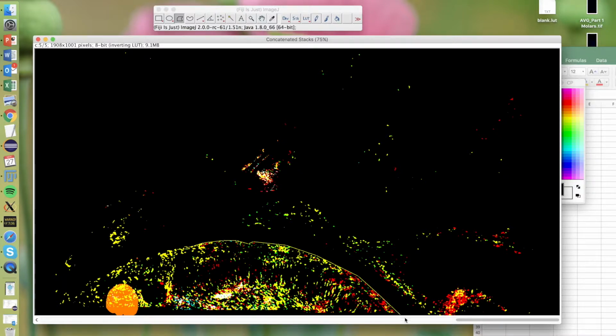Again, you don't need to worry too much about black space. Black space kind of gets ignored. It's just if there's other tissue there that you really need to worry about the actual boundaries. And as I said before, you can draw these shapes on a full image, not this binary one. It doesn't actually make too much difference as long as you can then just copy this channel over.